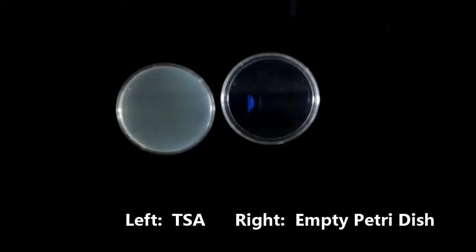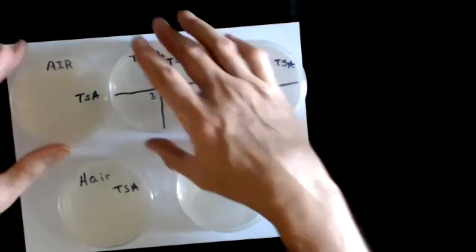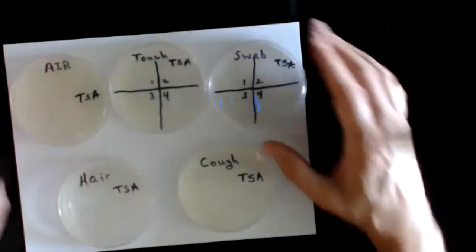We are going to use 5 agar plates that contain tryptic soy agar. In other words, I'm going to refer to these as TSA plates. And your module would instruct you to label the plates before you use them. I've already done that for you. So here you can see the 5 plates already labeled, already marked up.